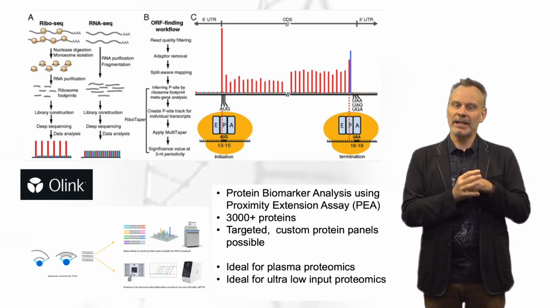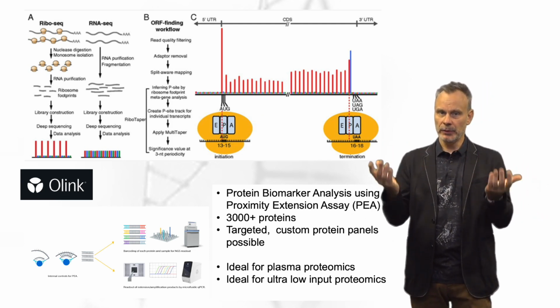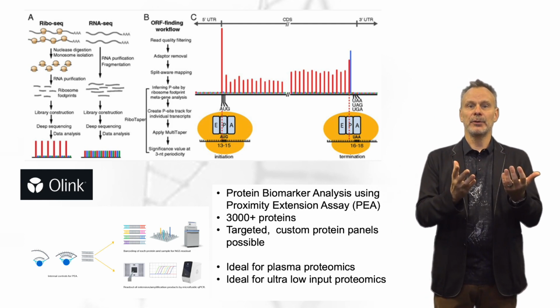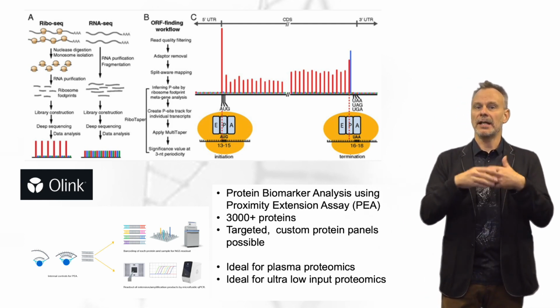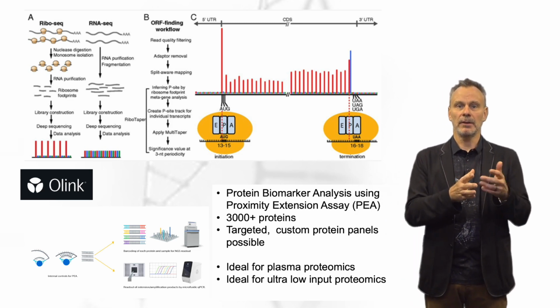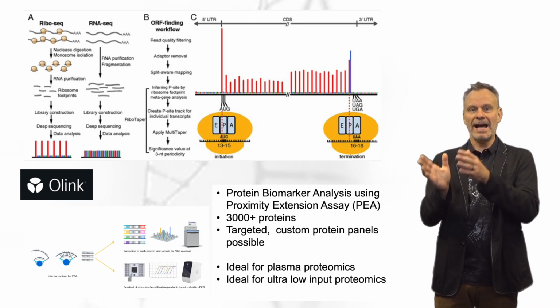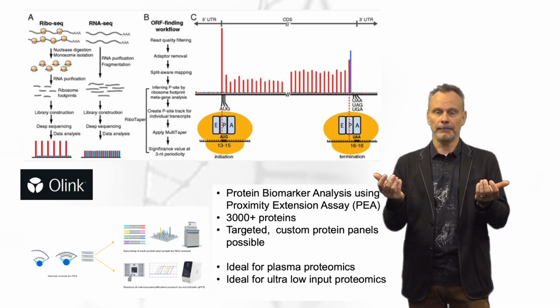The fourth application domain in which we can apply our methods is the domain of proteins, proteomics, which includes studying the entire set of proteins in a sample, leading to insights about protein structure, function, and interactions. A first method that we employ is ribosome profiling, also known as Ribo-Seq or ribosome sequencing. It's a method to monitor the positions of actively translating ribosomes on mRNA on a genome-wide scale.